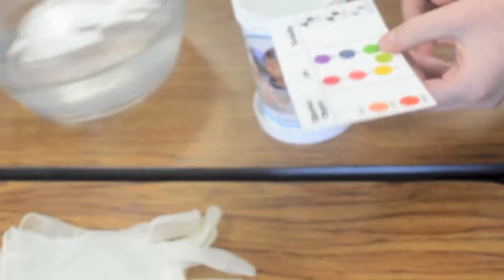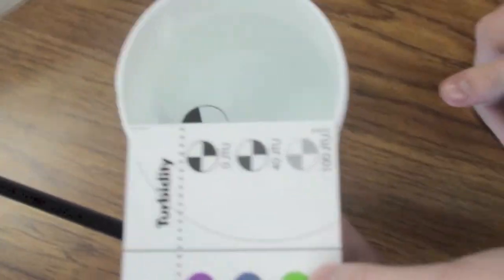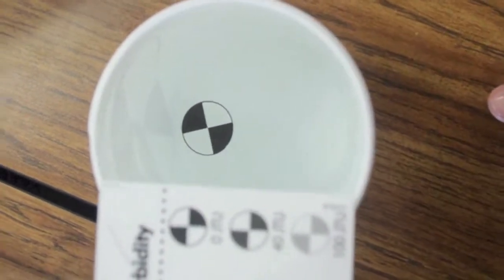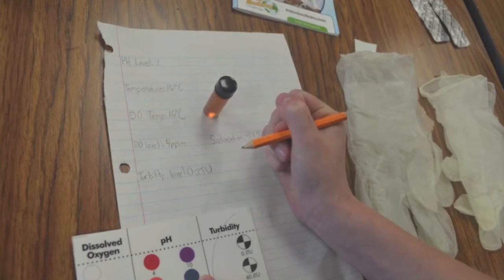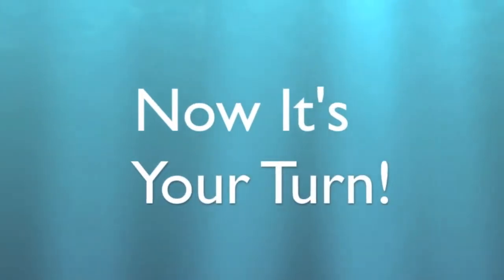Hold the turbidity chart at the top edge of the jar. Looking down into the jar, compare the look of the disk to the chart. Record the turbidity in JTU. Now it's your turn.